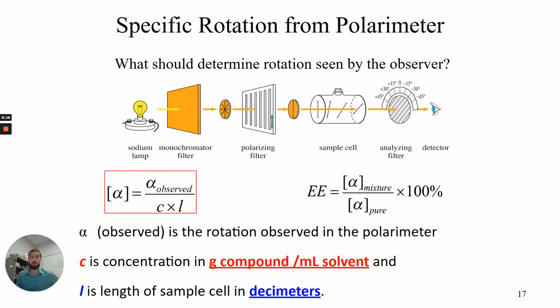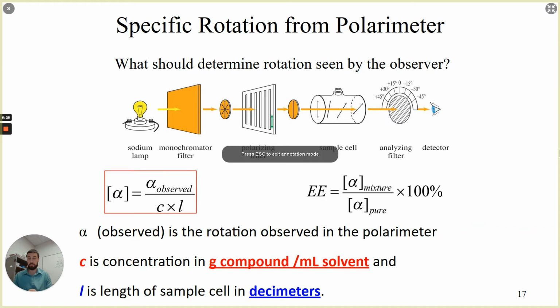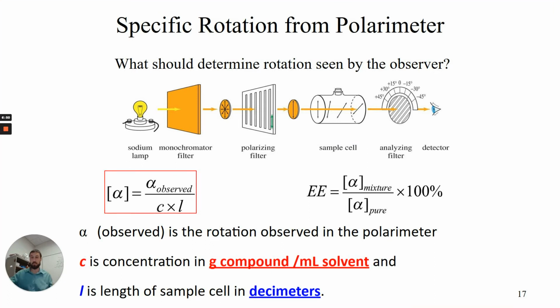So from our polarimeter, we can now get these numerical values. Those numerical values can give us some information. Remember, as we talked about, we're going to encounter some issues when we're looking at that sample. Remember, I said that as the light comes in, if it impacts a molecule, the light rotates. Well, what if you have more molecules? If you have more molecules, the light's going to rotate more. That shouldn't have an effect on the absolute rotation of our sample.